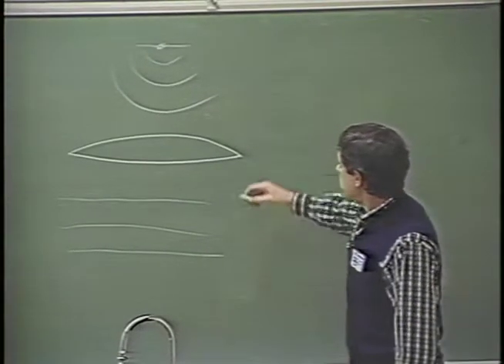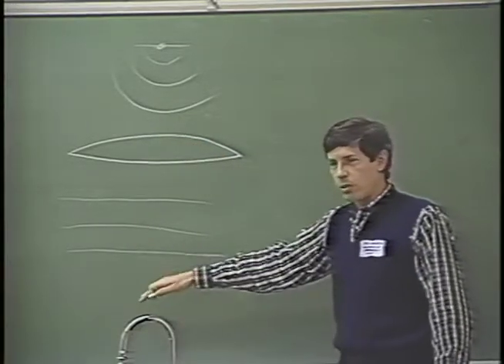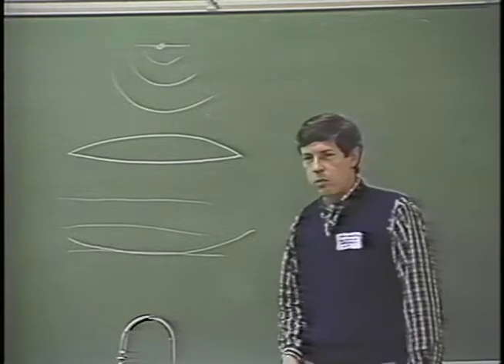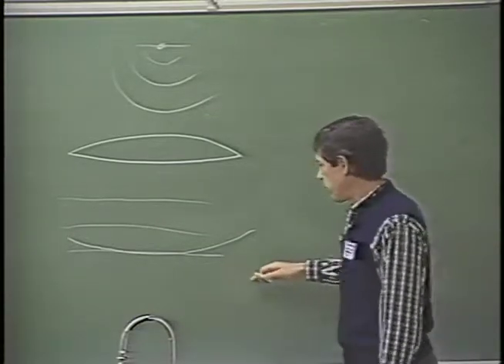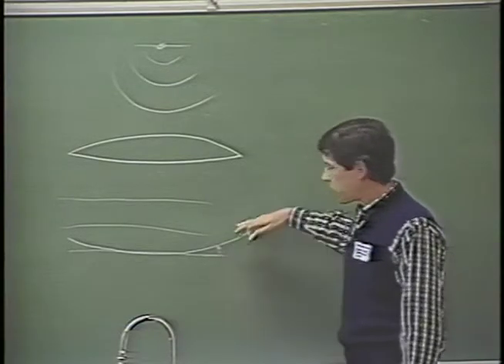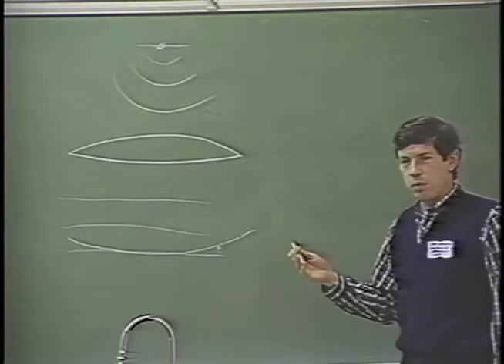And in that case, the curvature of these waves will be different when they enter the objective lens, and the result is that coming out of the objective lens, the waves will no longer be plane waves, but they'll be spherical waves with probably some large curvature, but they won't be quite plane waves. And we describe by this difference in position between the spherical wave and the plane wave, that corresponds to a phase shift. And that's the shift that actually produces the image contrast.